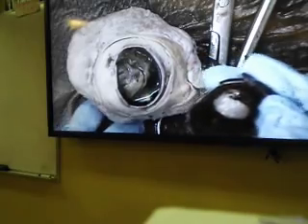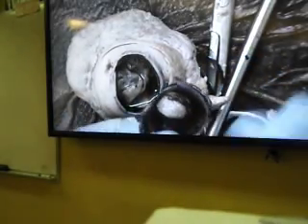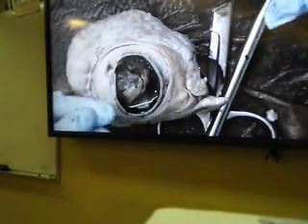I hope you understood some basics so that it will be easier for you to do the dissection. Please make sure you bring your goggles because aqueous humor will spill when you do the dissection session.